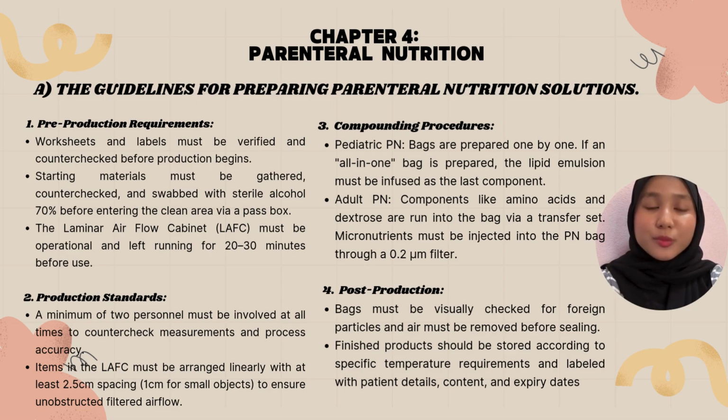Once inside the clean room, we follow strict work patterns. At least 2 personnel must be present at all times to counter-check every measurement. Inside the cabinet, we arrange materials linearly, spacing vials and ampoules at least 2.5 centimeters apart to prevent any disruption to the filtered airflow. For small objects, we maintain a 1 centimeter gap or use a zigzag pattern.